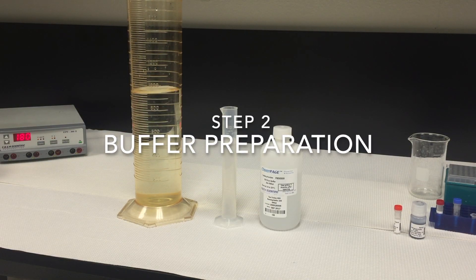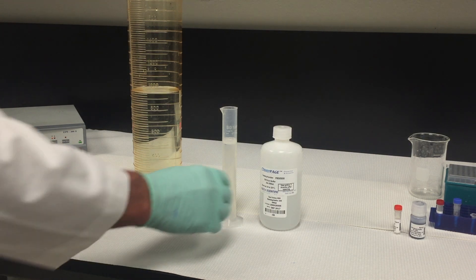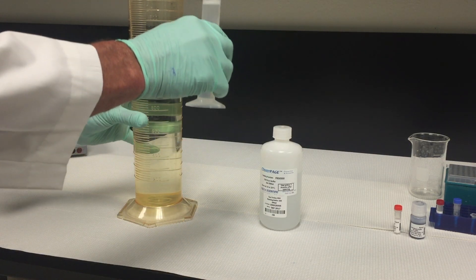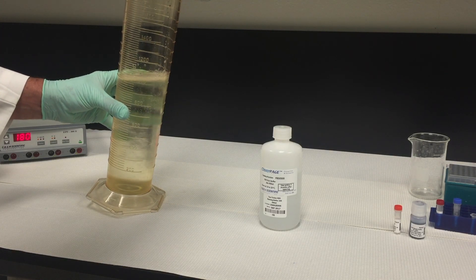Step two: buffer preparation. ClearPage running buffers must be used to run ClearPage gels. To make one liter of 1x running buffer, dilute 50 ml of the 20x running buffer with 950 ml of UltraPure water.